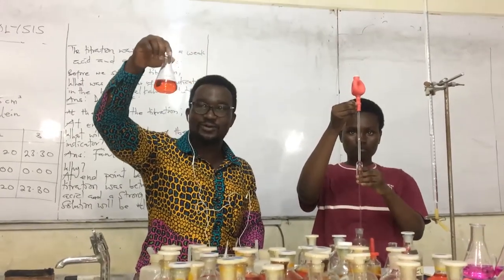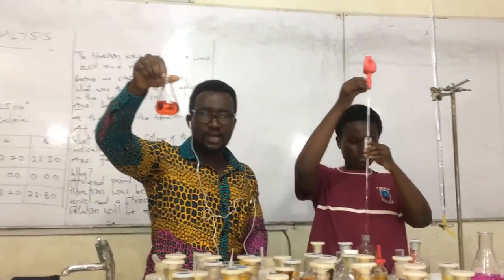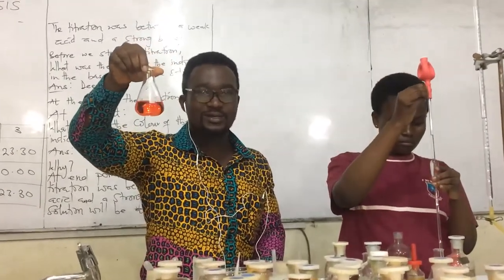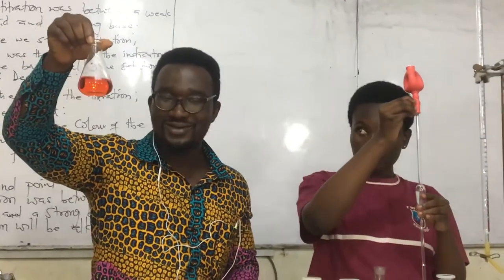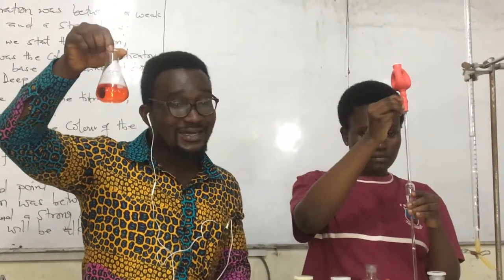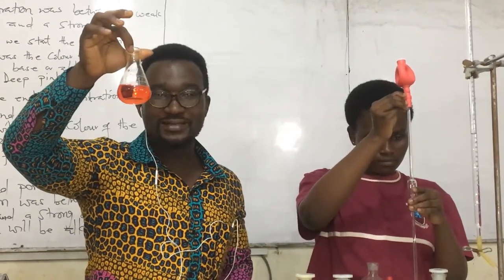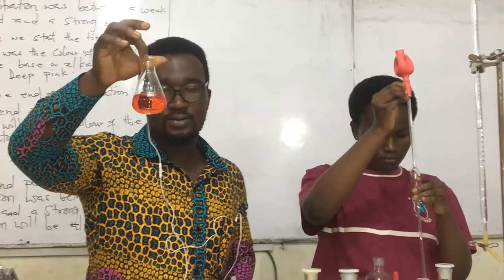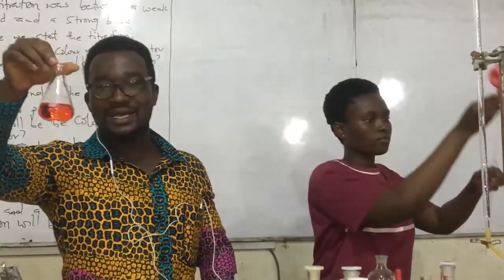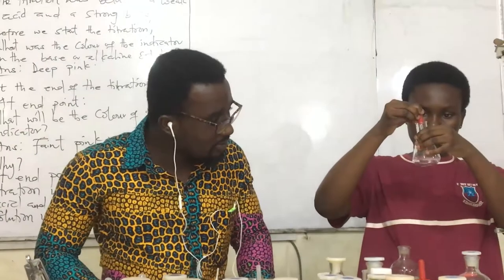So, that is the color. It's not red. It's orange. If you are confused with colors, you can go to Google and check colors of orange. You see them. My dear candidates, don't be deceived. When you go to the university, you need the precise color. So that is the orange color.